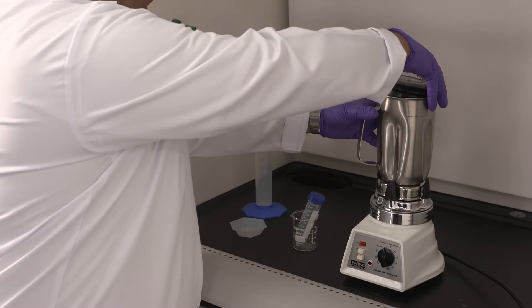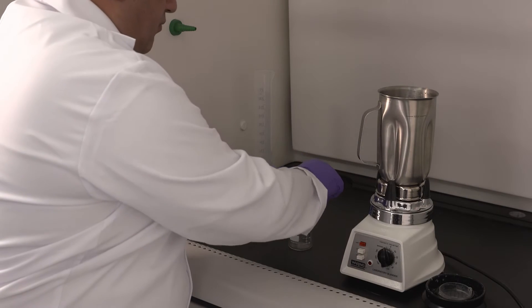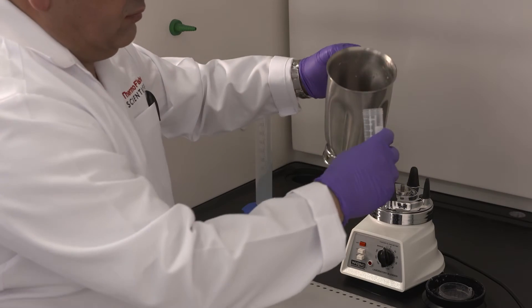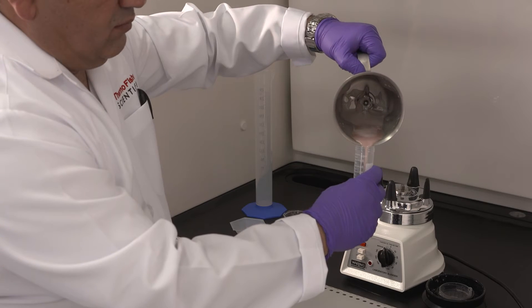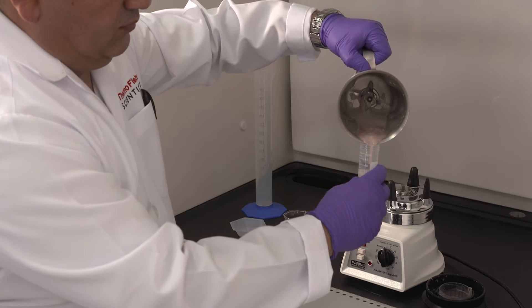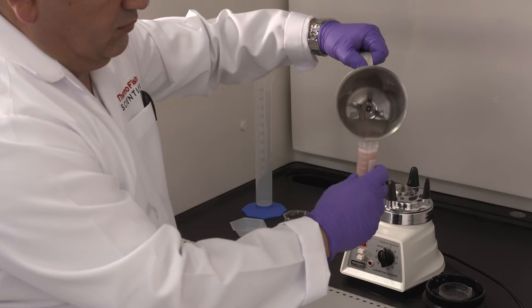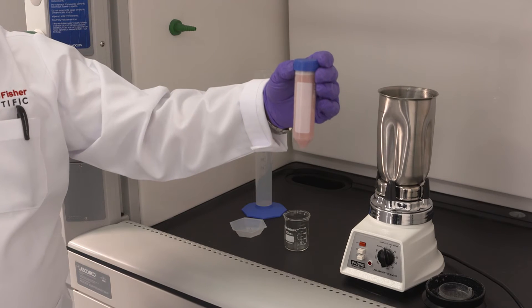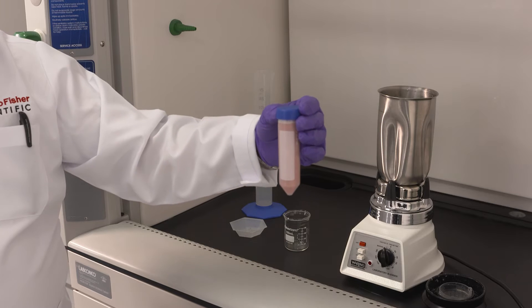After 2 minutes blending, the mixture will be transferred into a centrifuge tube so we can remove the debris from the mixture and use the supernatant to extract the protein. As you can see, the mixture is blended. There's still some particles but it's normal. Now we'll go to the next step where we will centrifuge this mixture.